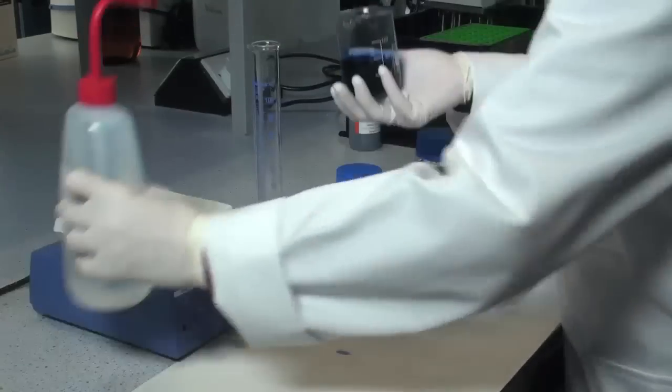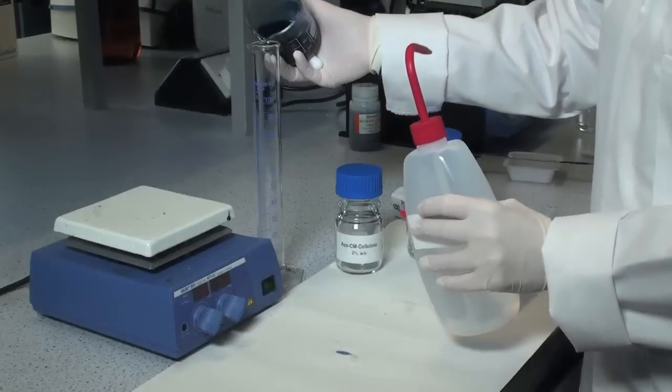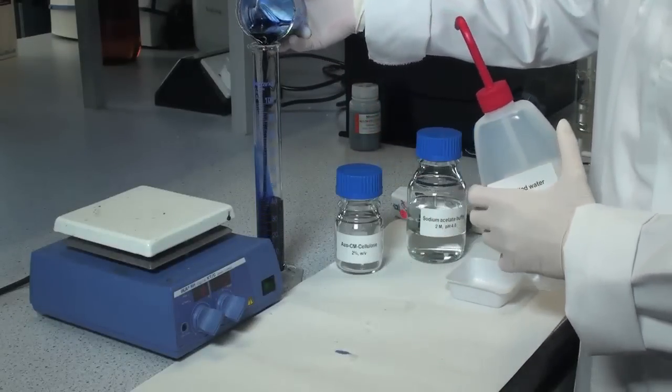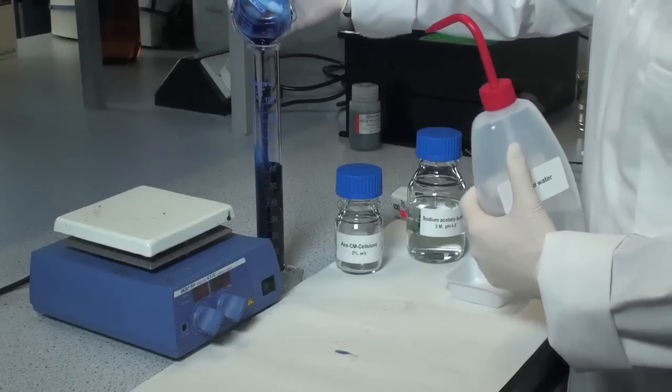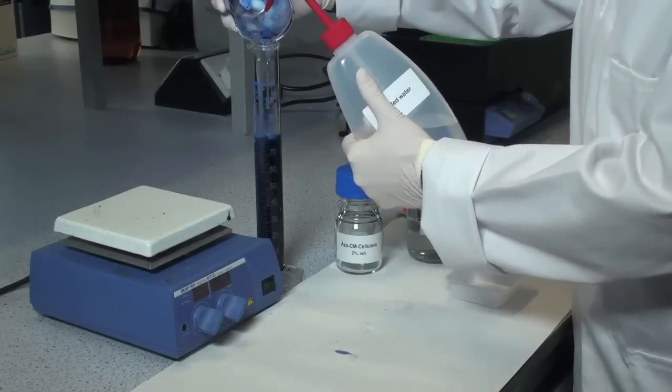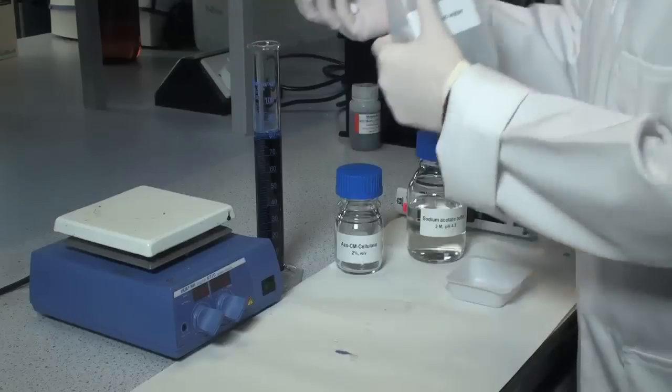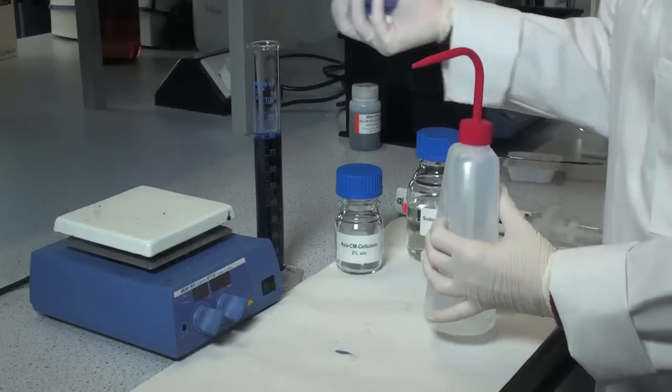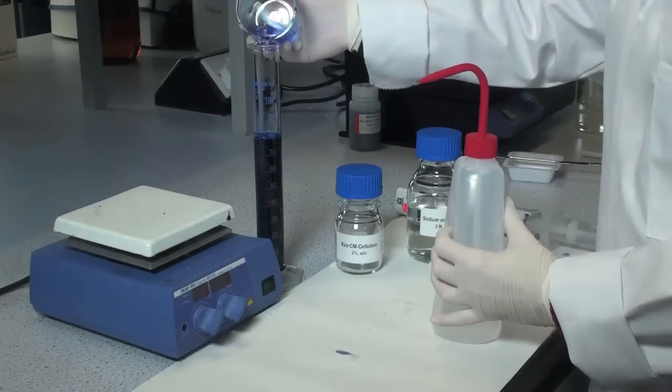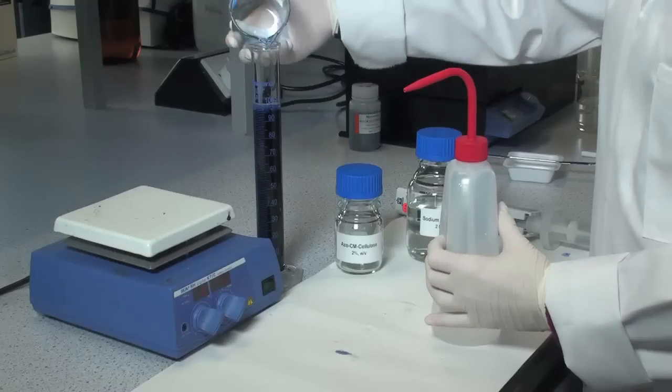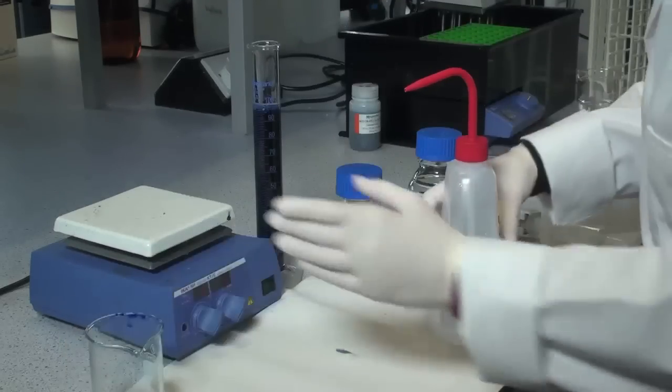Then adjust the volume to 100 ml by transferring the substrate to a 100 ml measuring cylinder, rinsing out the beaker to get the remainder of the substrate, and then adjusting the volume to 100 ml with deionized water.